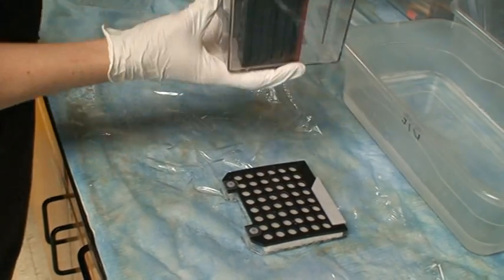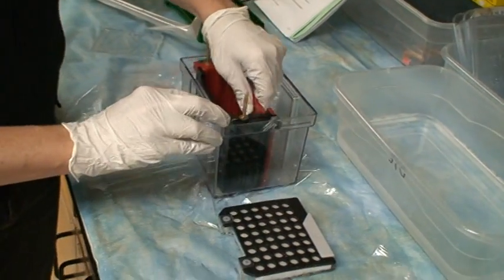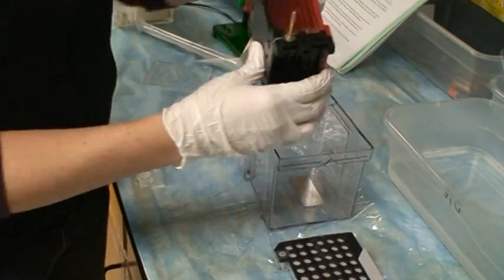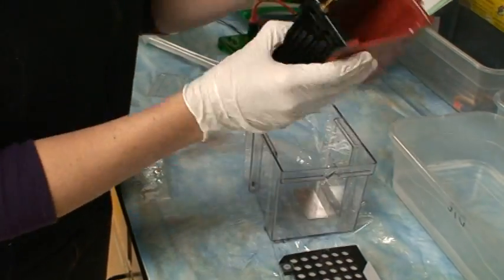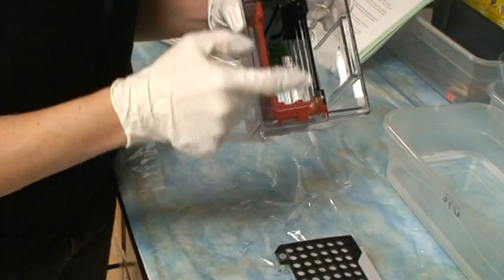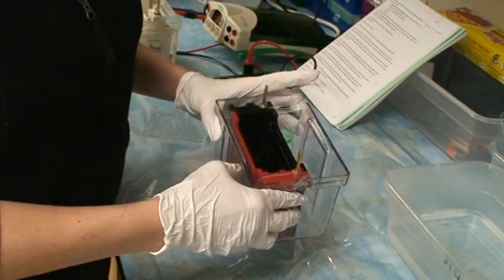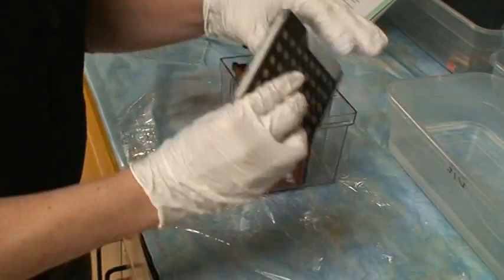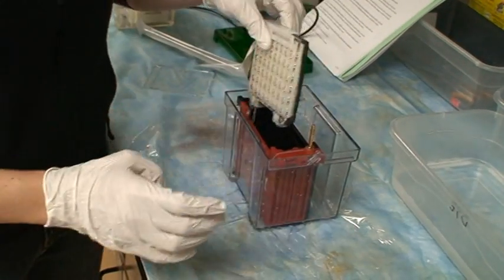You then take your transfer box with our transfer insert. You want to put it together such that these prongs are in the middle of the box. And then black goes to black and clear goes to red.